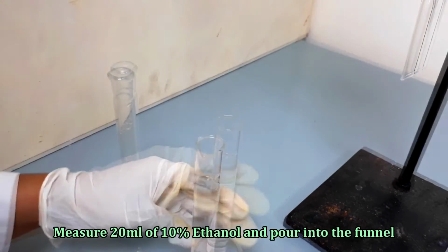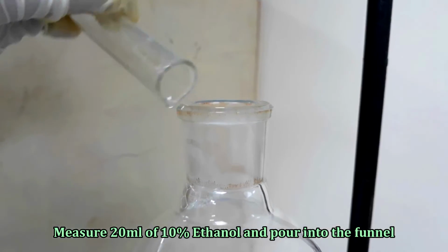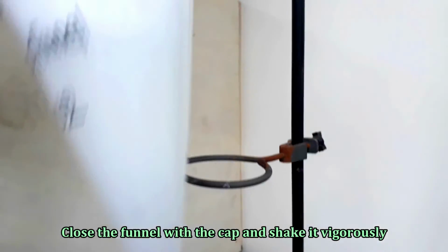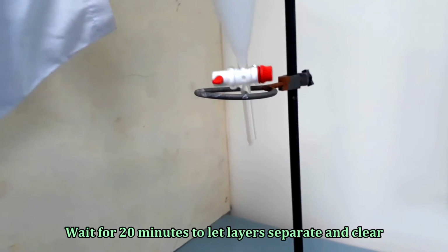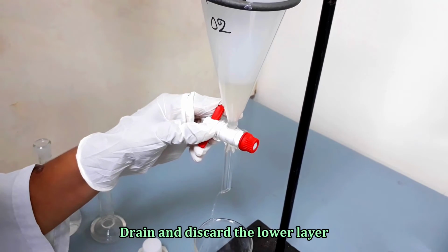Now add 20 ml of 10% ethanol into the separating funnel. Close the funnel with the cap and shake it vigorously. Wait for 20 minutes to let layers separate and clear. Drain and discard the lower layer.